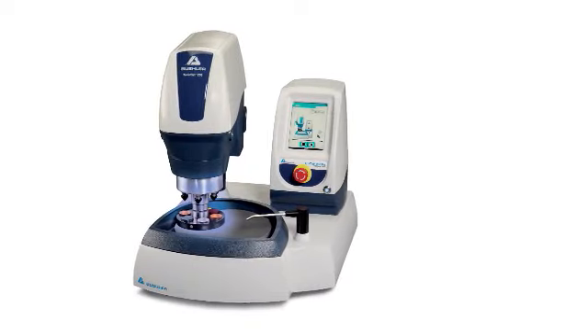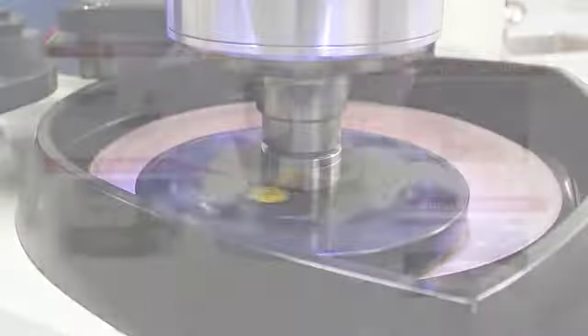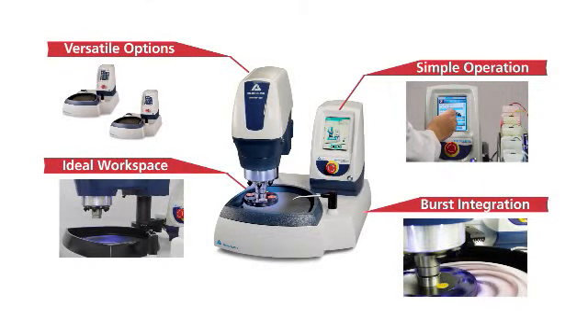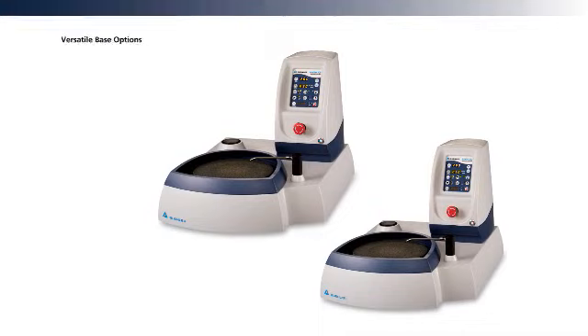Versatility and durability for specimen preparation. Versatile enough to handle manual preparation, high throughput applications, and any combination in between.